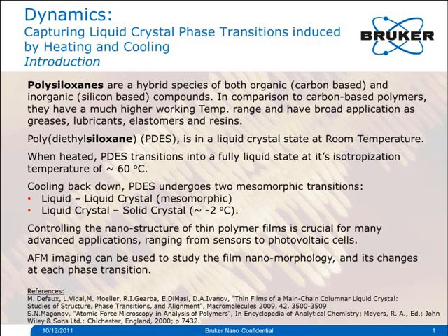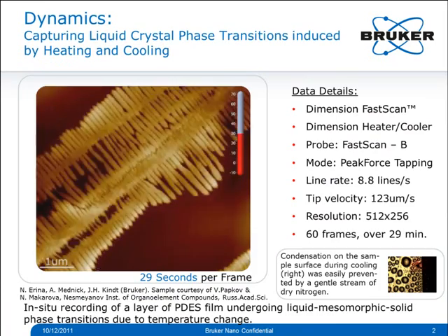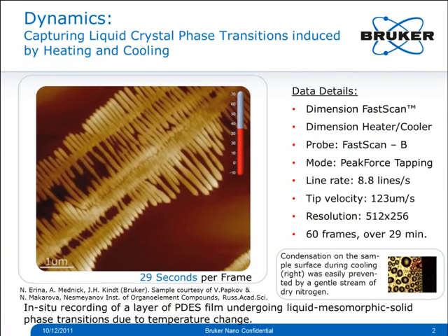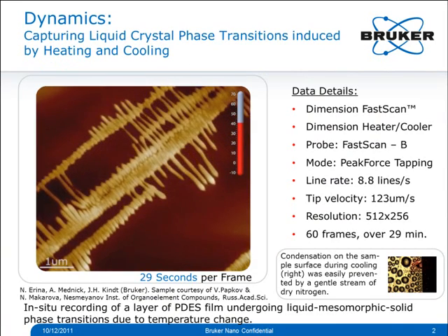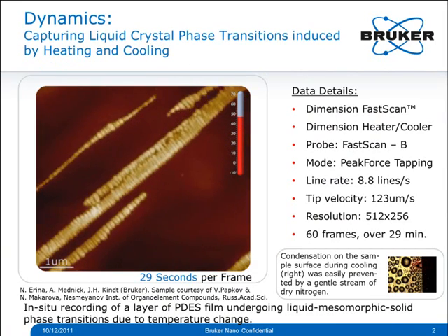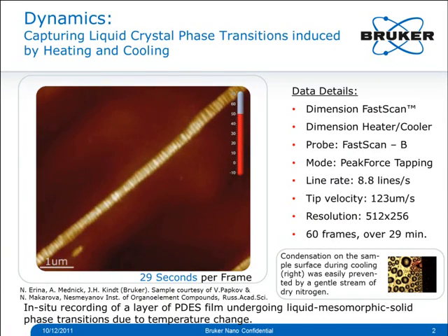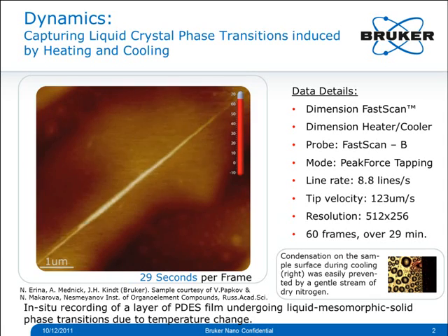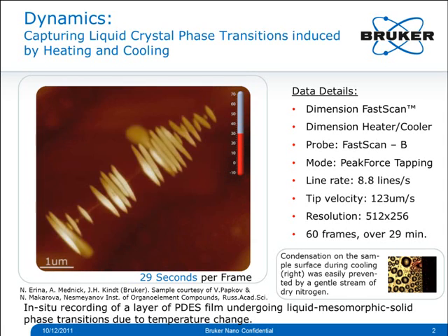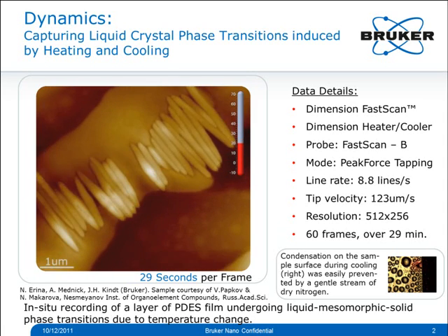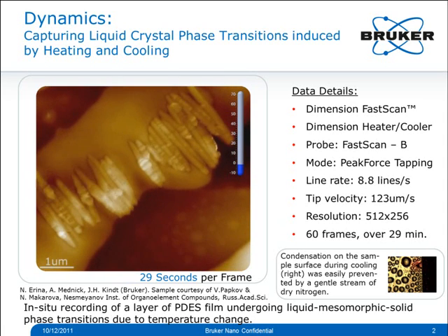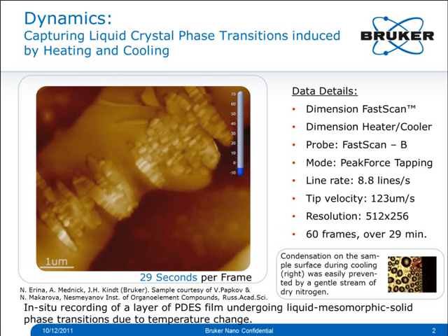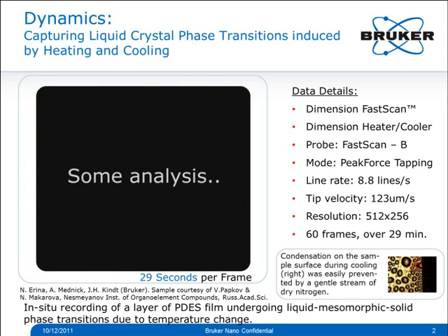Let's watch this movie. Here is a film of PDES oriented in the direction that it was rubbed onto the sample, being heated up to 70 degrees C and now being cooled down to about minus 2 degrees C.